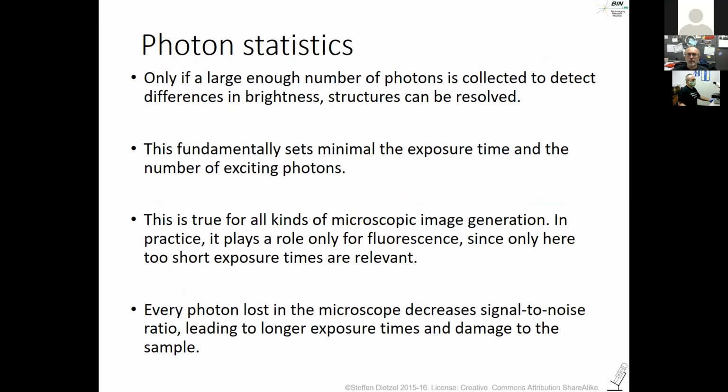So only if you collect enough photons can you be certain that you can resolve certain features in the sample. And so you either have to take longer exposures, or use more excitation light, or average a number of images. Every photon lost in the microscope is going to cost you, so try to minimize those losses.